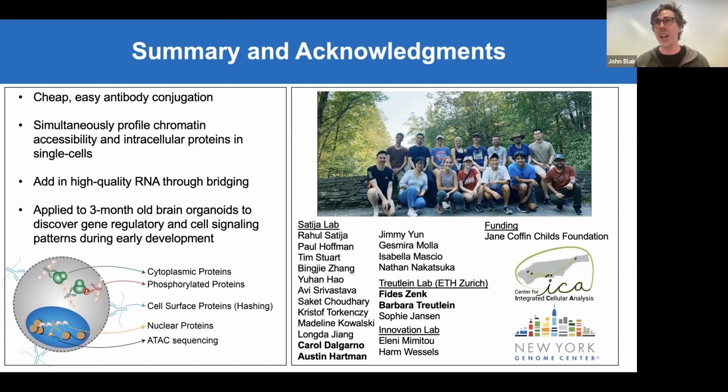So when I say phospho-RPS6, in this case, I'm really referring to phospho-RPS6 at serine 235, 236. But if you want to look at 240, 244 as well, which I know there's another highly specific antibody, you could include that in the assay and that would work.